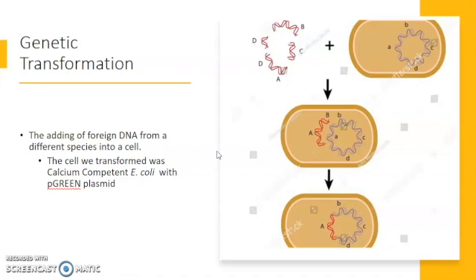In the picture to the right, it's going to show this genetic transformation of the foreign DNA on the left, labeled BDDAC, entering into the cell and then joining up with the DNA of the original host cell.